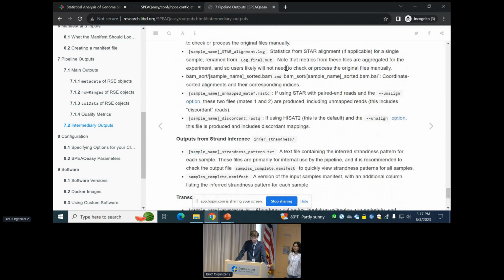Do you have any checks? So you go past QC, but then you just keep going through the whole pipeline. Yes. And nowadays the sequencing data is so nice and so beautiful. Our sequencing center at Lieber goes ahead and does trimming, so I don't really ever have to do anything. Before, it'd be like, oh, it's really bad, I need to do quality trimming or this or that. Do you get reports on that?